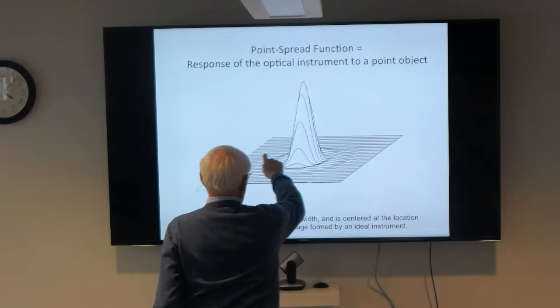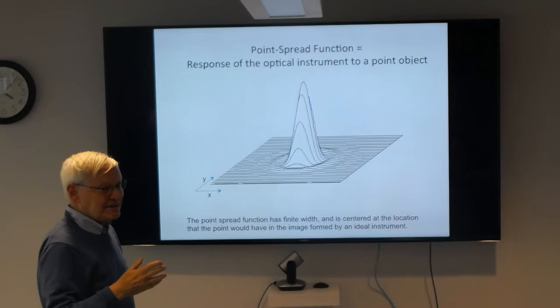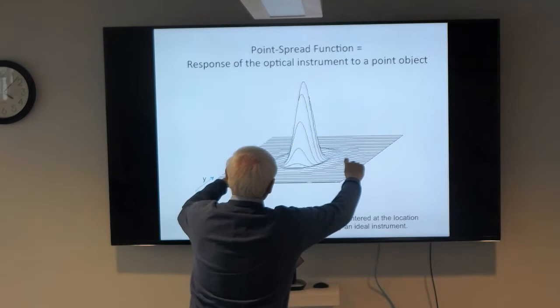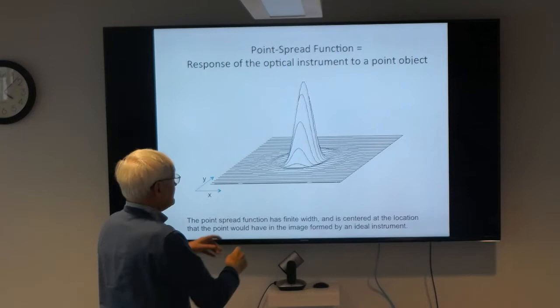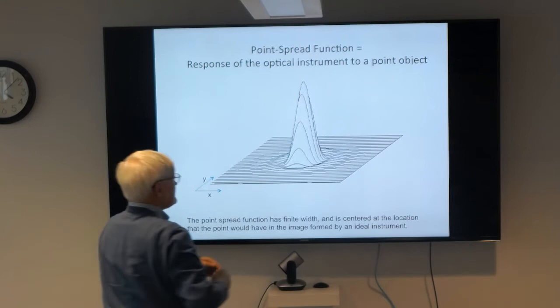feet. They're called feet because apodization means taking the feet away. Apodization in light optics means making the lens in such a way that the feet are gone. Okay, so these are sort of feet here. And depending on the defocusing, these feet can be very strong, which means that you will have effects that are very far away from the point that is being imaged.